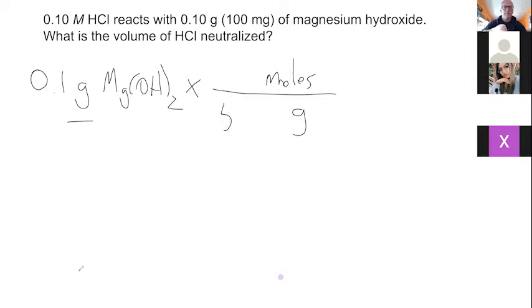58.3197. Okay. So that'll tell me how many moles are in that one little tablet that I ate.